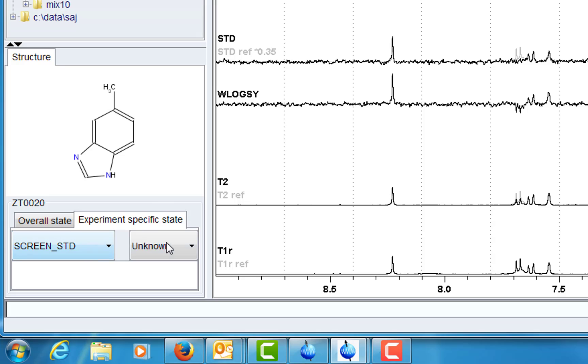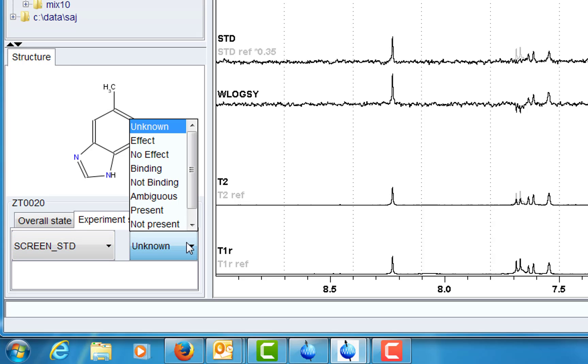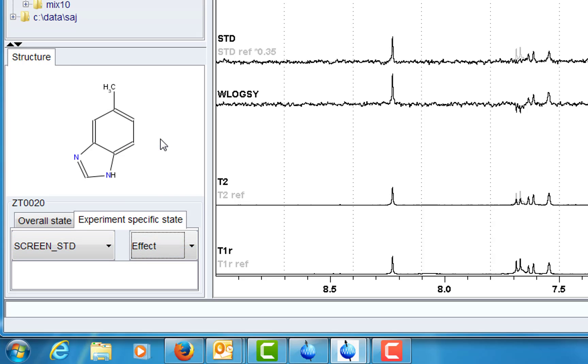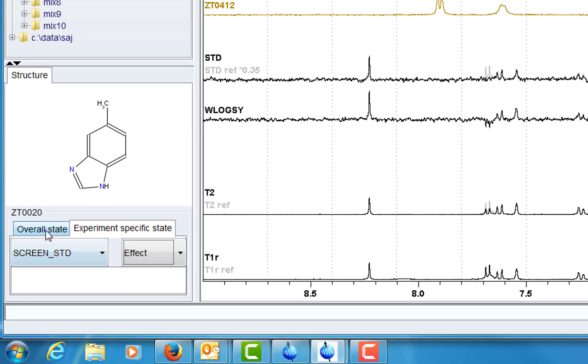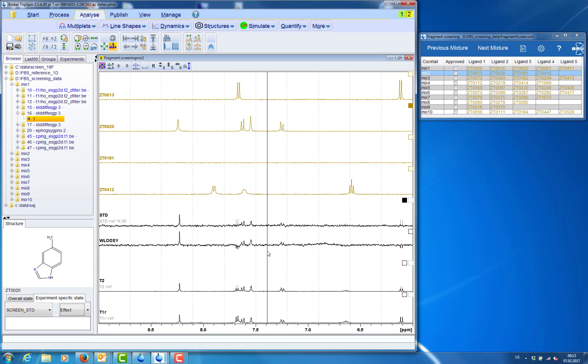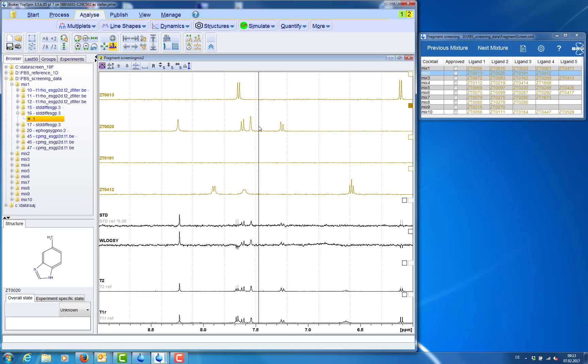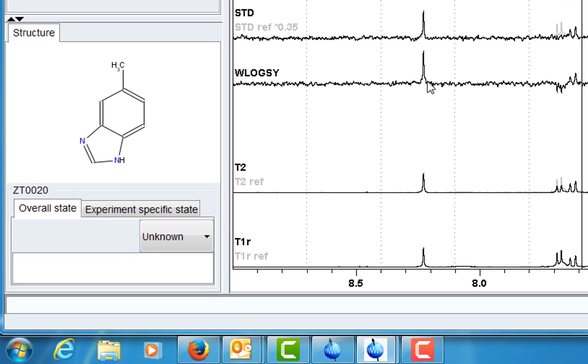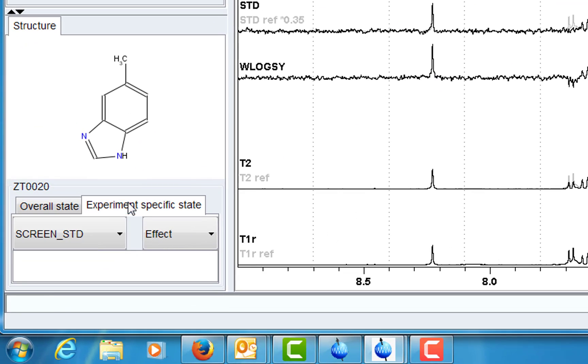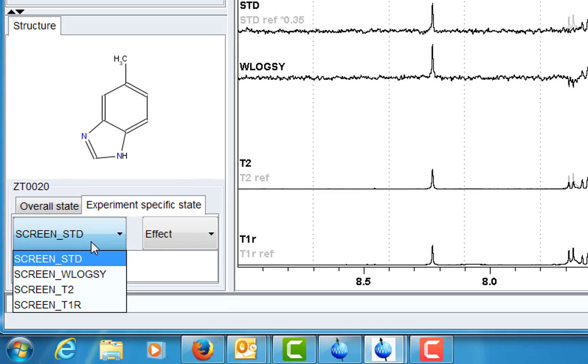When selecting a ligand we can annotate an experiment specific state. For example here we have an effect in the STD spectrum. And we also have an effect in the water LOXY spectrum.